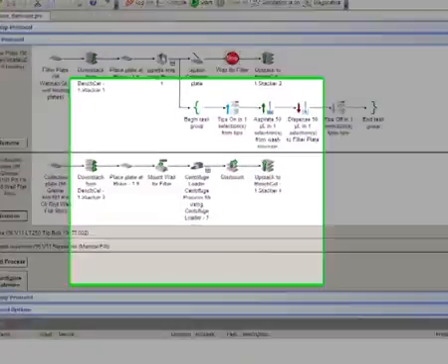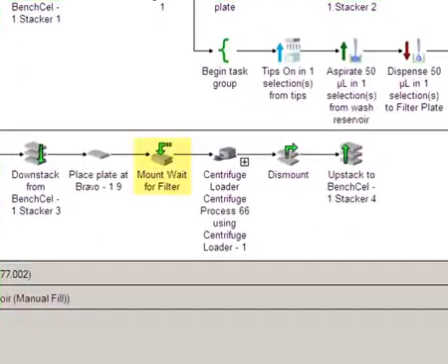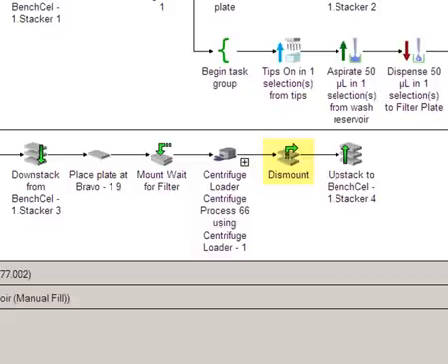The mount task is typically used to place a filter plate on a reservoir that catches the eluent. After the centrifuge process, you can use the dismount task to remove the filter plate from the reservoir.